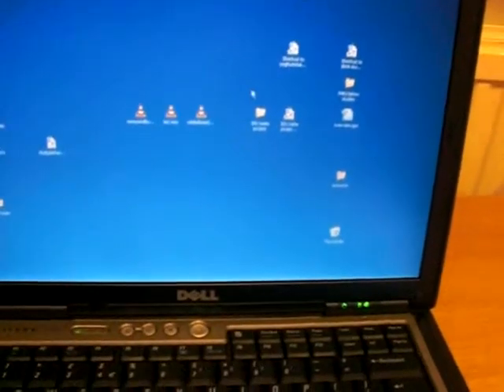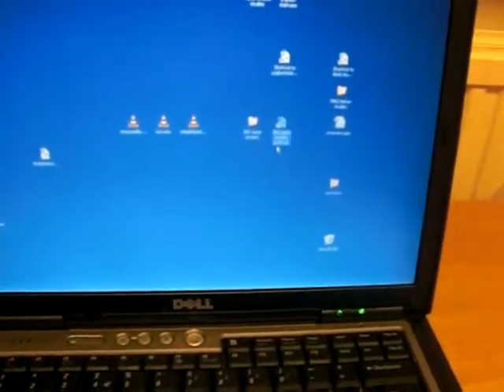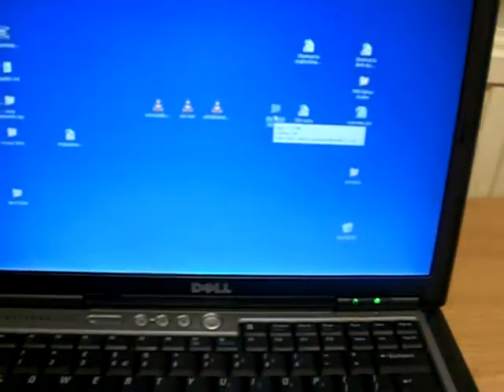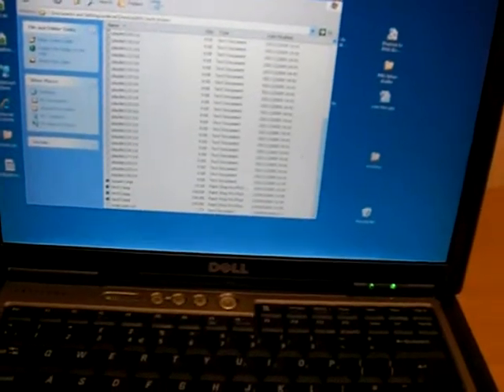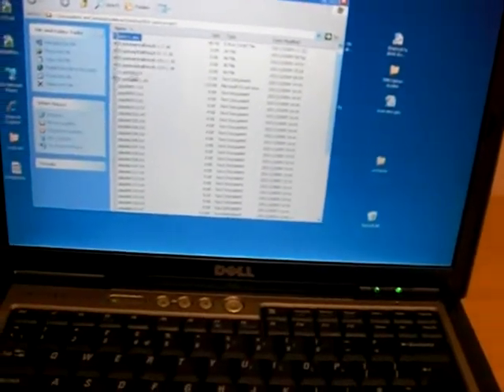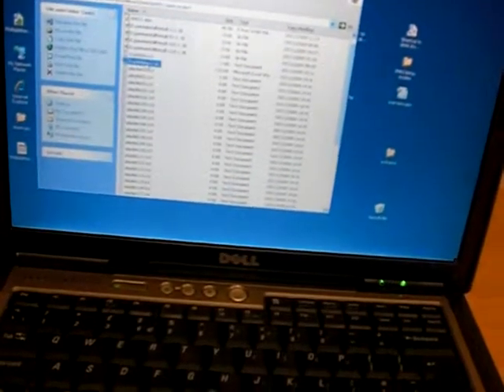I'd like to talk to you about the folder within which all this information is held. So here's your shortcut to the experiments. Right next door to it is the folder in which everything is held. Now you'll notice within this folder there are several key files. There is the actual experiment itself, aw11.ebs at the top, very hard to see unfortunately. There's also this experiment maker 3 button icon, and there's several other lots of information here.